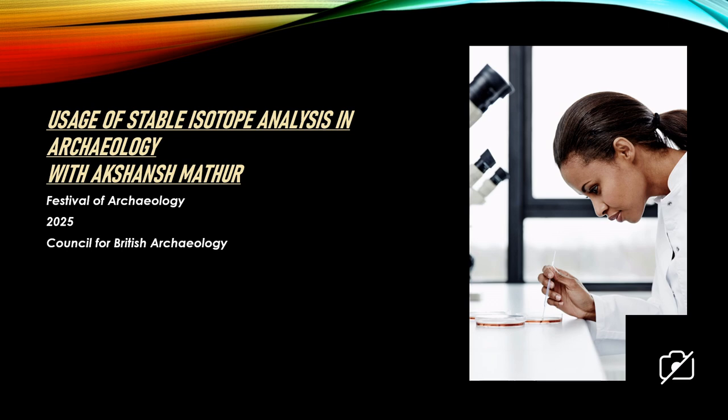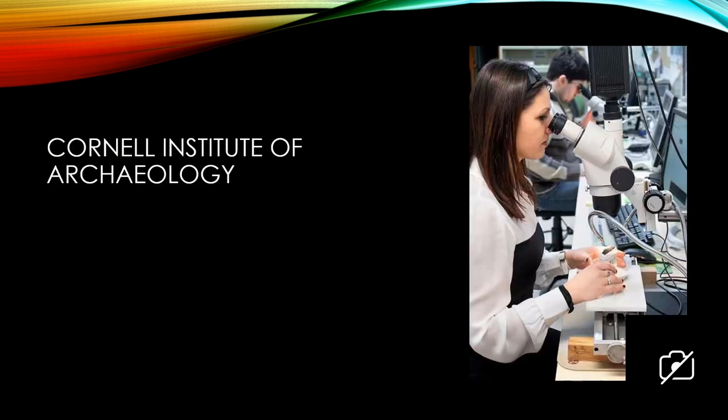My research area is the applications of archaeometry techniques like stable isotope analysis, lipid residue analysis, etc. Today I am talking about one of those techniques. Its name is stable isotope analysis. What is the use of this technique in archaeology to solve archaeological questions?